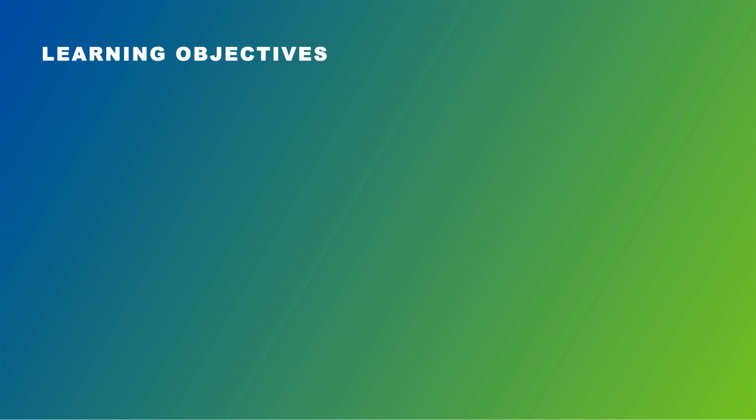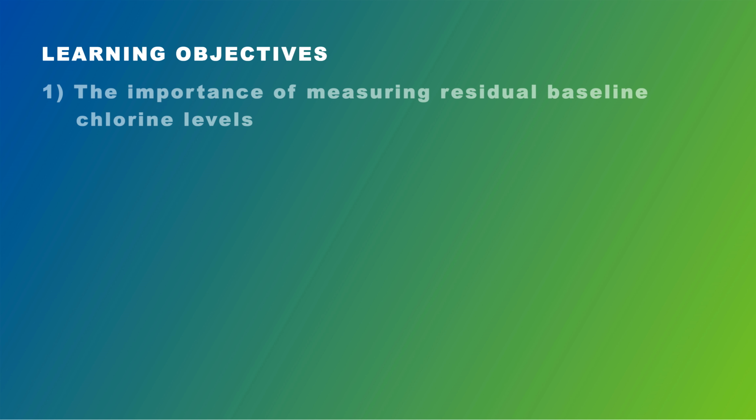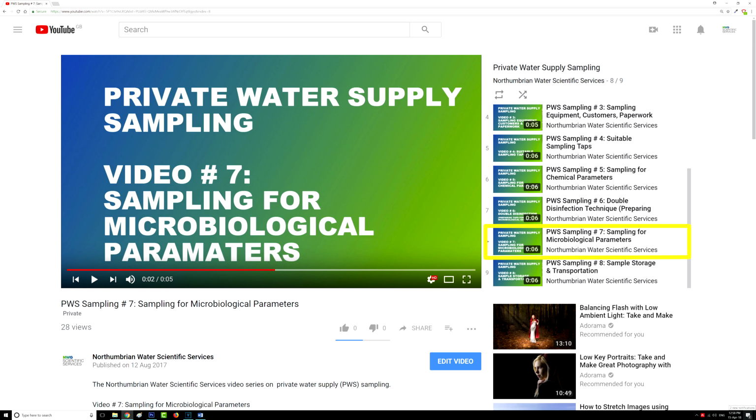This brings us to the end of this video. As promised, we've explored the importance of measuring residual baseline chlorine levels, the correct time points at which to measure chlorine, and the double disinfection technique for disinfecting taps before microbiological sampling takes place. Now that you've correctly disinfected the sampling tap, it's time to move on to video number 7, which focuses on how to take your microbiological samples.